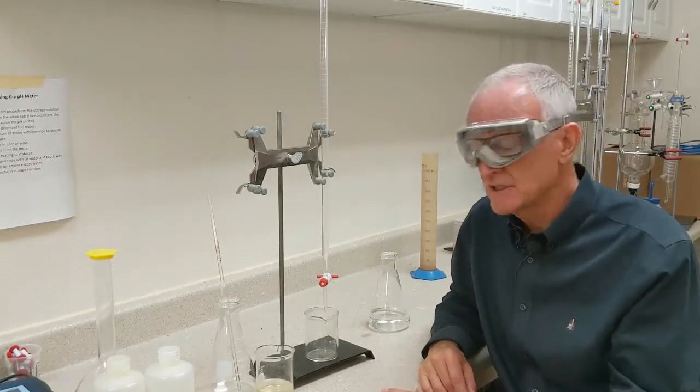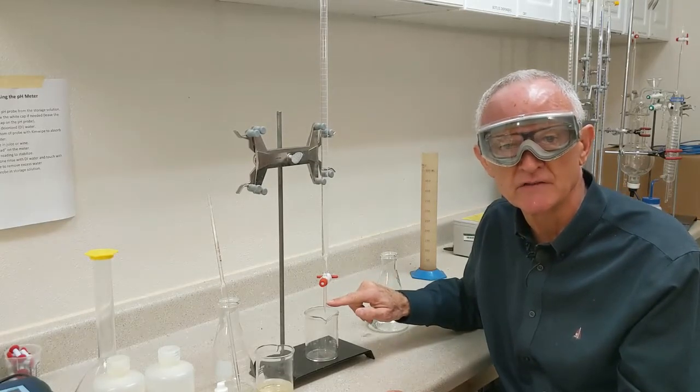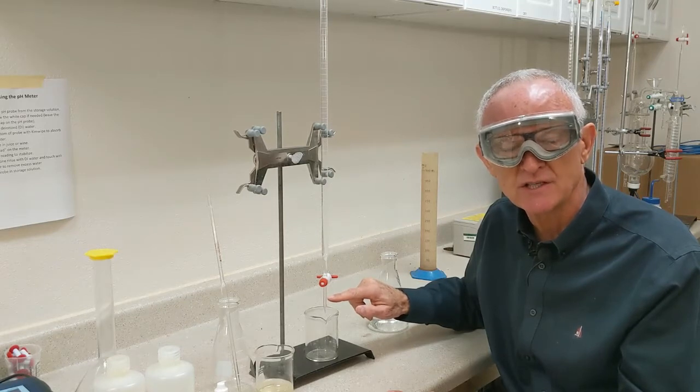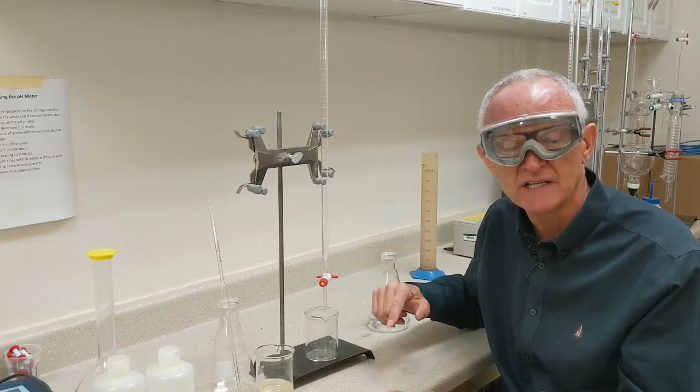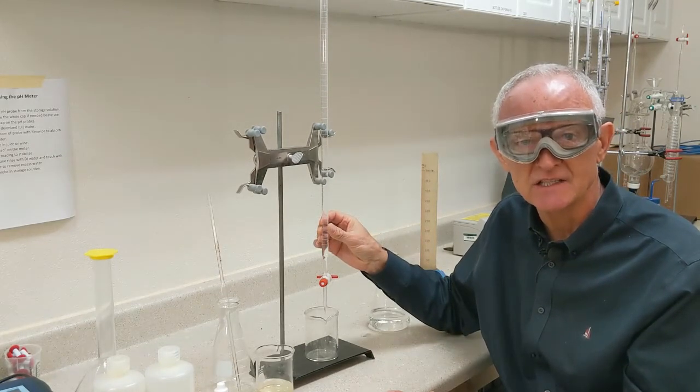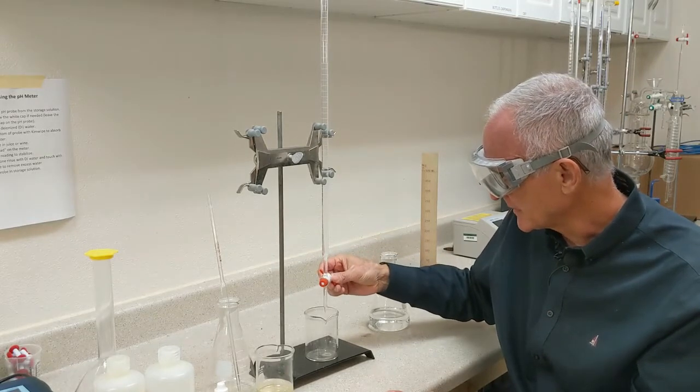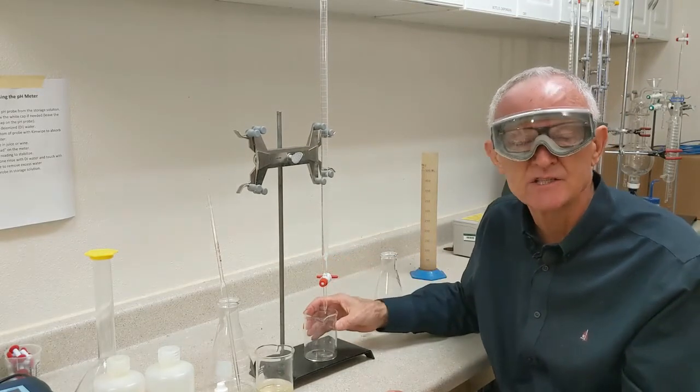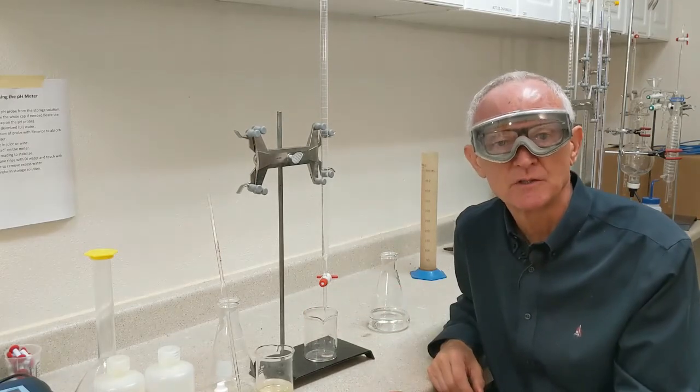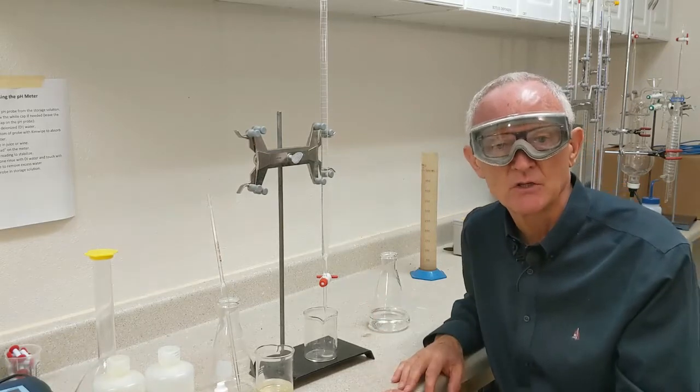The next thing I'm going to do is make sure that this little tip down here is full of sodium hydroxide. Because if we don't fill that before we do a titration, we will overestimate the amount of sodium hydroxide we needed to neutralize the acid in our wine. So I'm just going to drain a little bit of that into a waste beaker here. I'm going to check, make sure there are no air bubbles in that little tip. Nothing leaks, so I'm good to go.